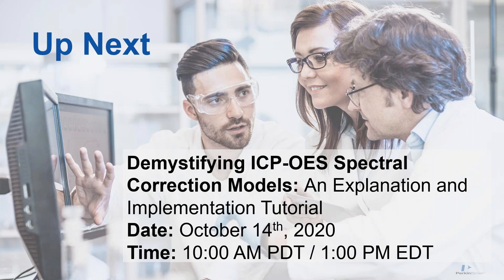It was actually a funny story. When I was first doing this, I did not run the single elements. I ran the mixed element standard. And I was in the lab, and one of my coworkers came by and he's like, what are you looking at there? I'm like, that's arsenic. He's like, no, it's not. I'm like, really? He's like, no, that's not how it looks. So that's when I started running the single element standards and found out it definitely wasn't arsenic. It was definitely chromium I was seeing.